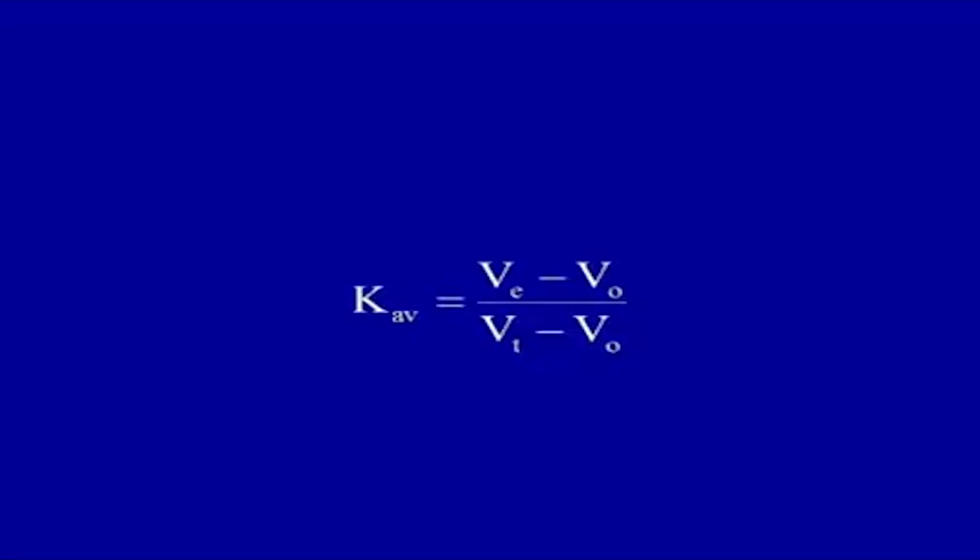So, the total bed volume can be measured by determining the elution volume of a small molecule which is not in the fractionation range, like salts or acetone. They could be utilized since they have complete access, they can easily move in. So, they just move with the mobile phase, and they spend the most time, and the elution volume could be calculated by utilizing a very small molecule.